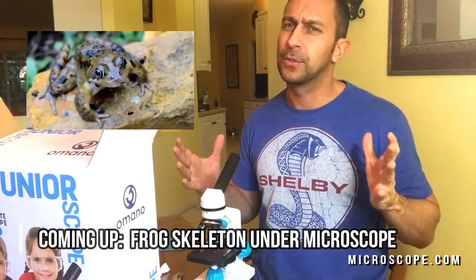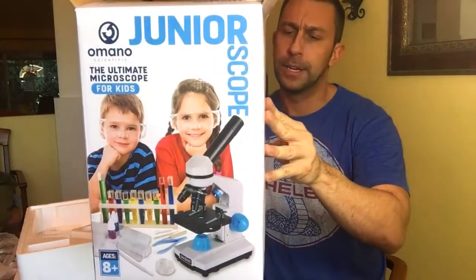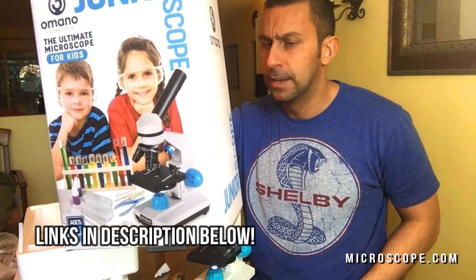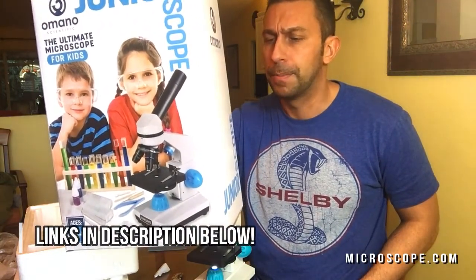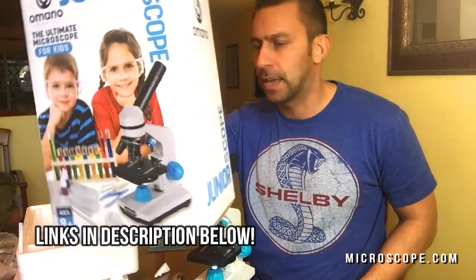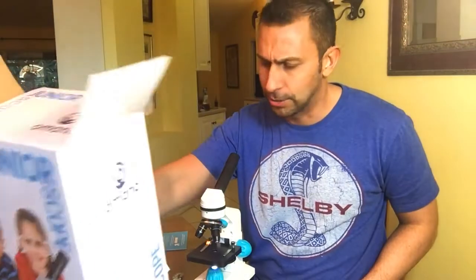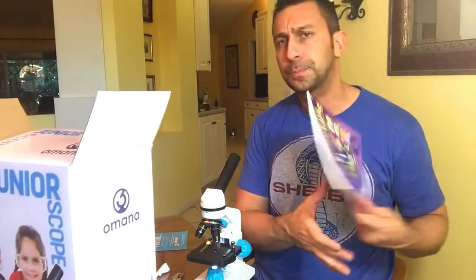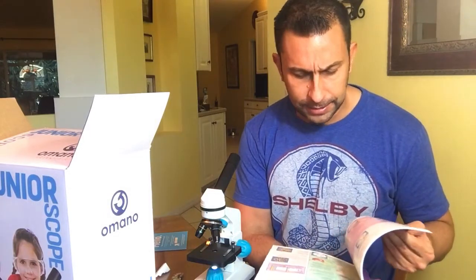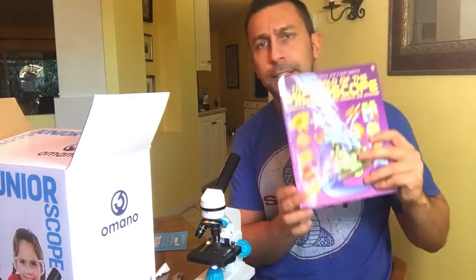What I'd like to recommend is that you get your kids a gift this Christmas that's educational and fun, much like this microscope. This particular one comes with a junior microscope, five blank slides, five prepared slides, cover slips, slide labels, lens paper, forceps, test tubes, wooden picks, cotton swabs, stain, a dissecting needle, blue stain, droppers, and all sorts of stuff. It's under a hundred bucks and also comes with a cool book to teach your kids about insects, dissecting, science — everything they need to know to become little scientists.